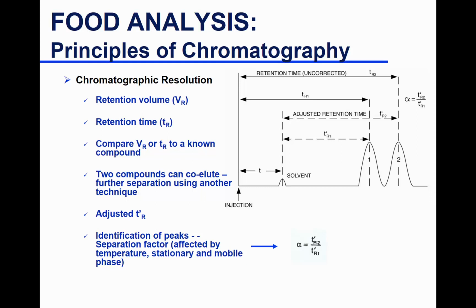Adjusted retention time is basically, there is this peak which we'll talk about a lot next week in lab, whether it's the caffeine or fatty acid lab. You have something we call the solvent front peak. So this is when you inject a sample, from the time of injection, the mobile phase is going through your column as well. At the time the mobile phase reaches the detector, the detector is going to recognize that something hit it.